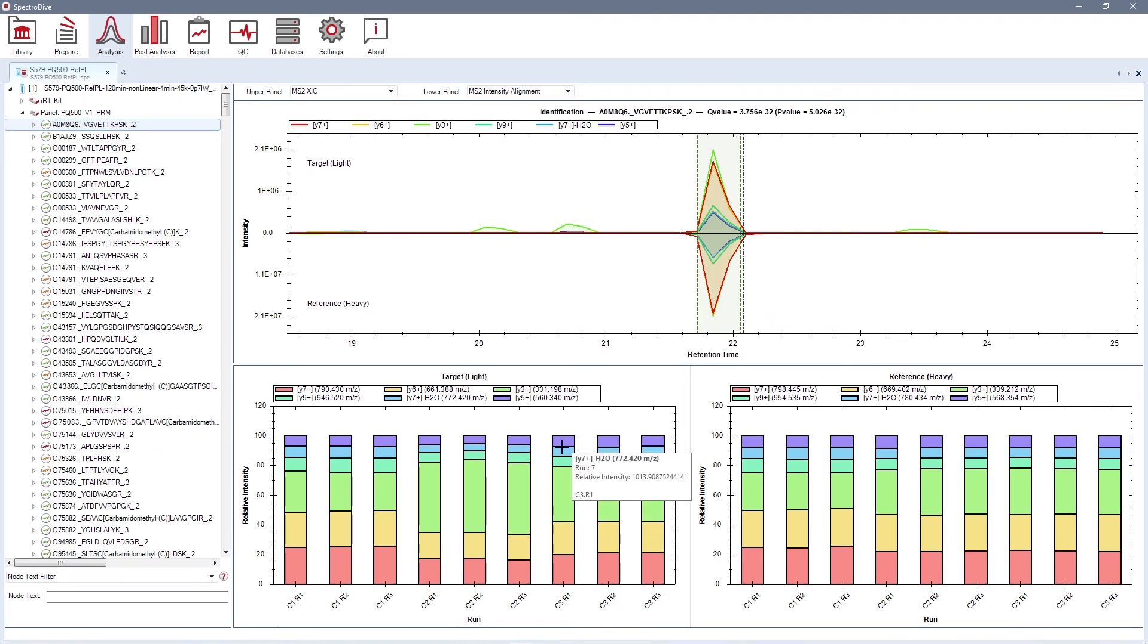SpectroDive applies a powerful machine learning peak-picking algorithm and FDR-based identification, so manual curation is not necessary. However, you can inspect and find your data here if you would like to.